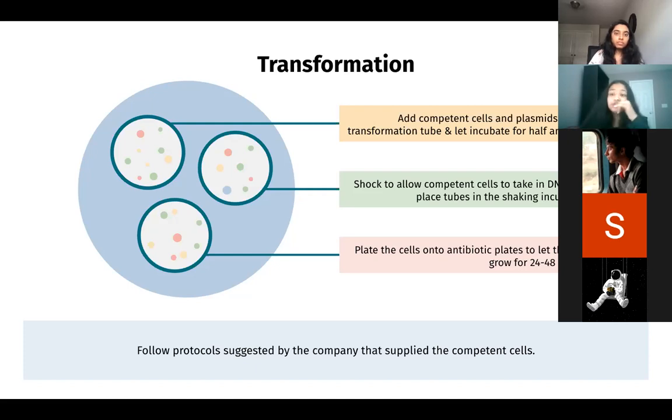Generally, your original insert that came with the plasmid and your desired insert are going to have two different base pair lengths. By doing a colony PCR, you can see the base pair length. So if my desired base pair length is 1400 and I got 1300, then I know that probably the plasmid religated to the original DNA, if that makes sense.